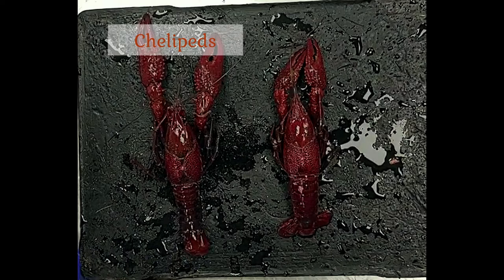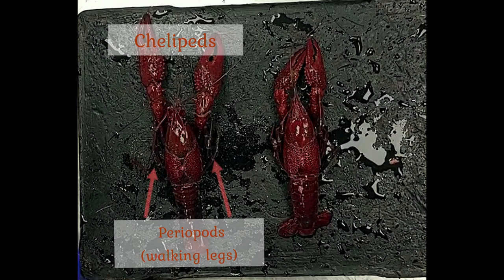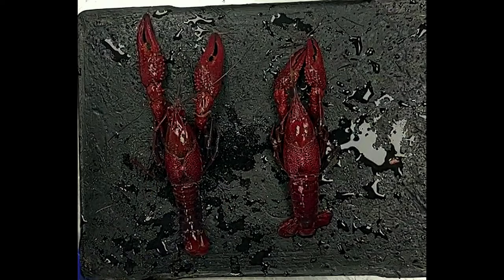We can also see some major appendages here. We have the big pinchers, or chelipeds, and then we also have these four pairs of regular periopods — walking legs. If you add that all up, you have two chelipeds and eight walking legs, giving you ten total appendages used for moving about. And that of course is where these decapod crustaceans get their name — decapod means ten legs.